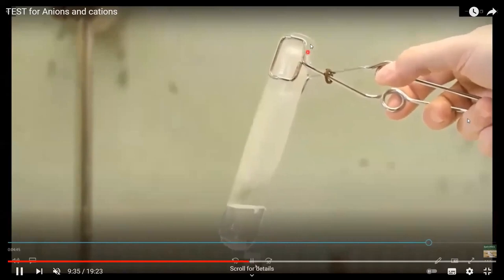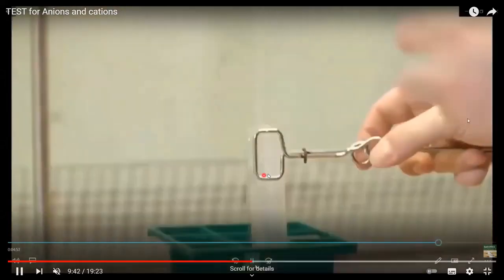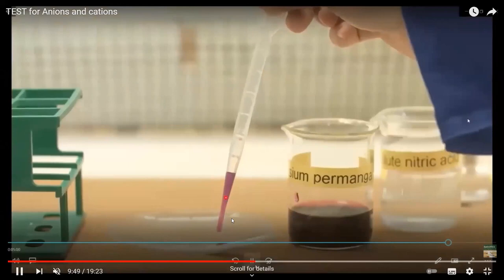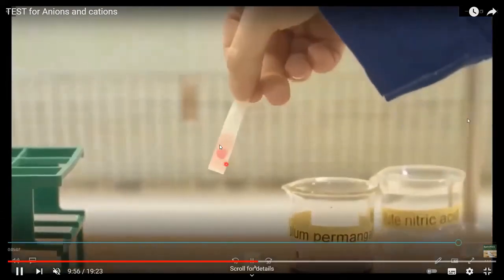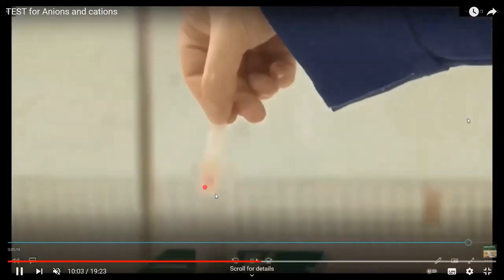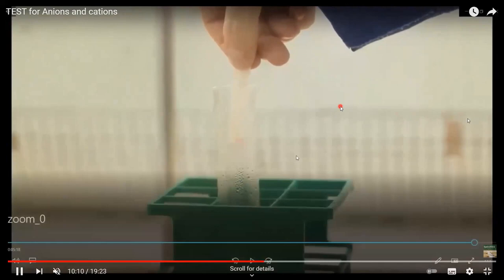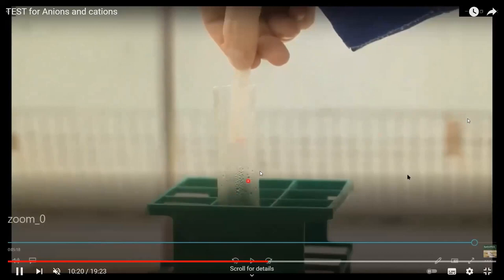And what will happen, the gas which is sulfur dioxide, when we pass it through a purple solution of potassium manganate, as you can see, we place a bung here just to trap the gas, sulfur dioxide. Either we can pass it or we can add potassium manganate, like potassium manganate is added to a paper and then we place it near the mouth of the test tube. So this purple color will disappear. You can see when you open, the purple color disappears. So purple color changes to colorless. This confirms that the gas which is released here was sulfur dioxide, and the ion which was present was sulfite ion. Sulfite ion means SO3.